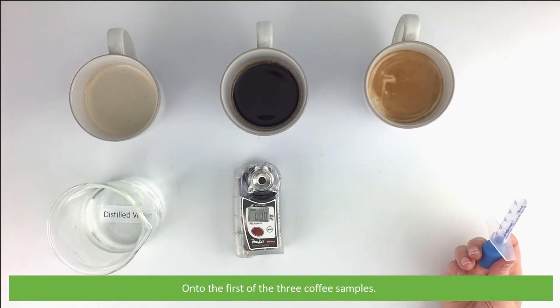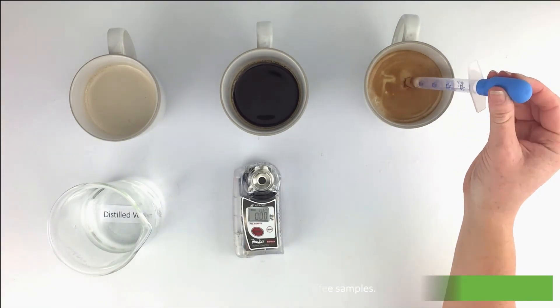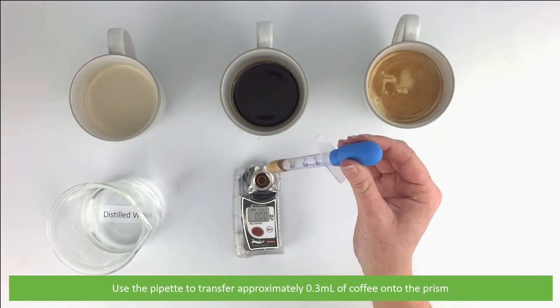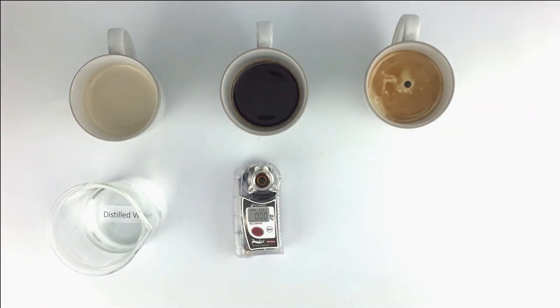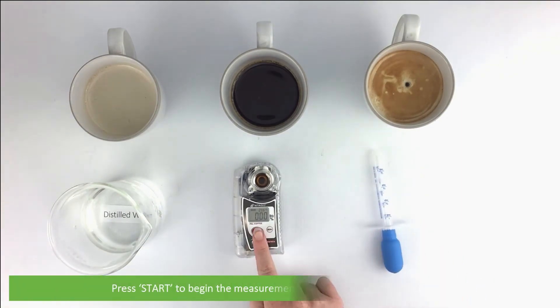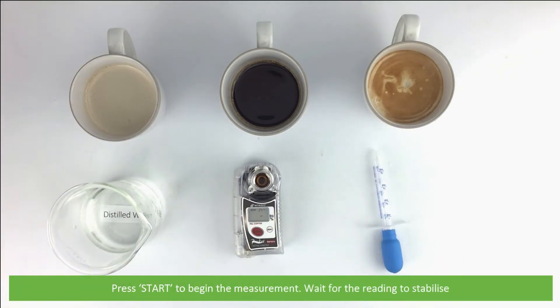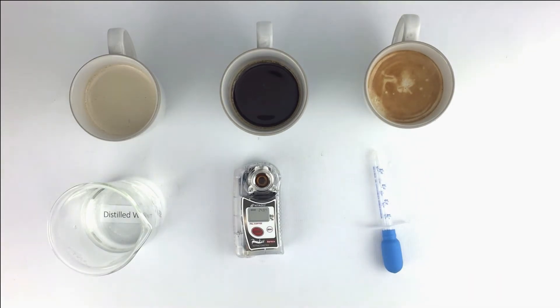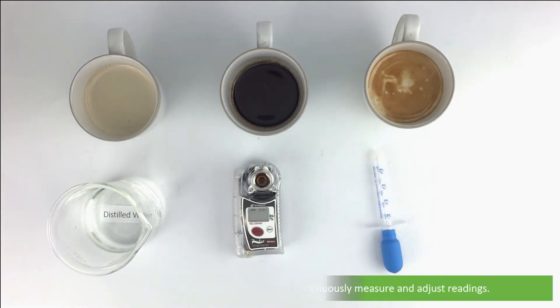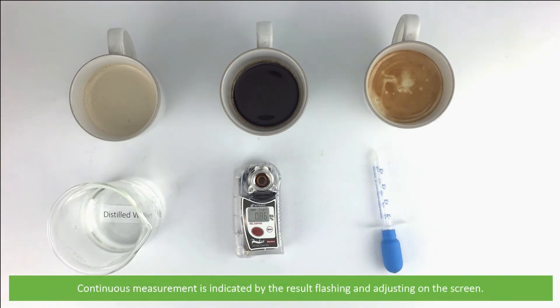Onto the first of the three coffee samples. Use a pipette to transfer approximately 0.3 mls of coffee onto the prism. Press start to begin the measurement and wait for the reading to stabilize. Once the first reading appears on the screen, the device will continuously measure and adjust readings.